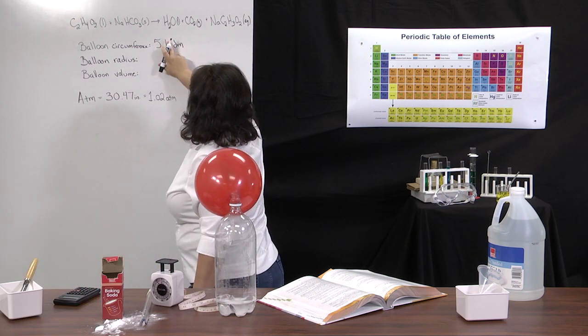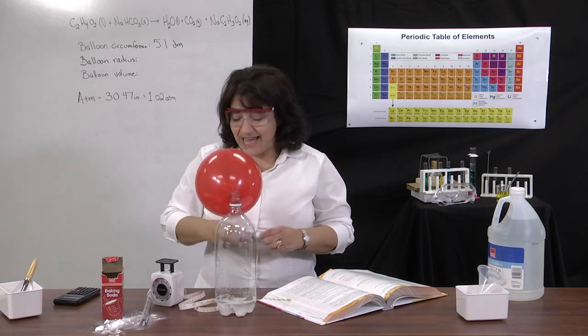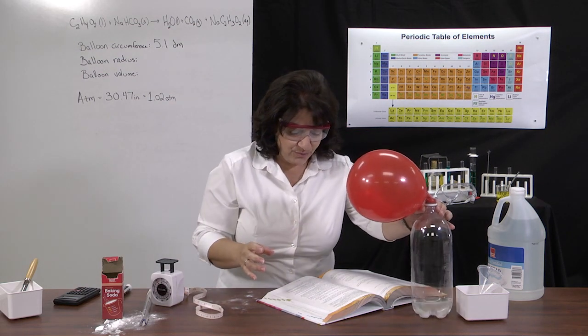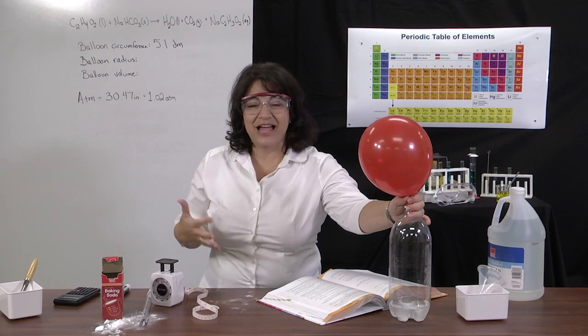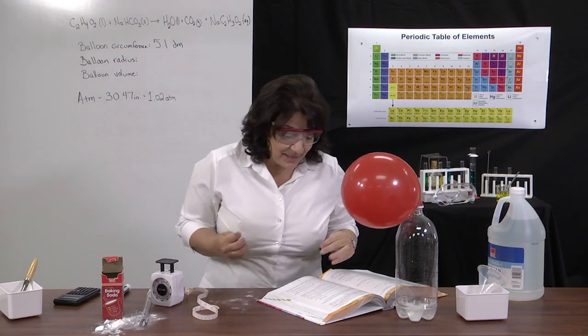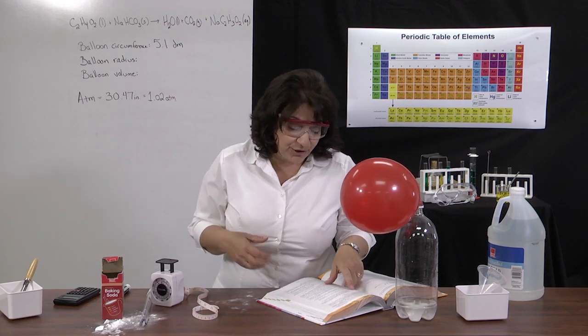And actually, it needs to be 5.1 because I measured to the 10th place. All right, let me just move this balloon over here for a few minutes because now we're going to do lots of calculations. The actual experiment part of our lab is over, but the calculations based on measurements will now be happening. So we need to find out the volume of this balloon.